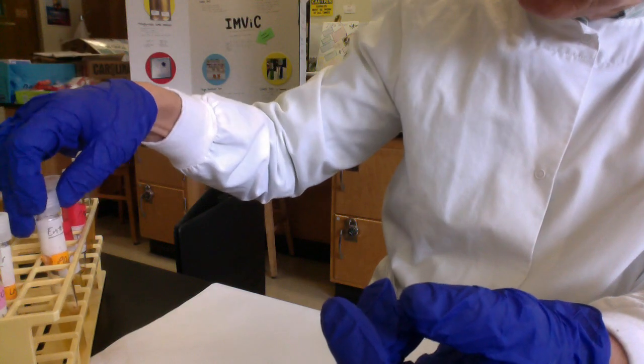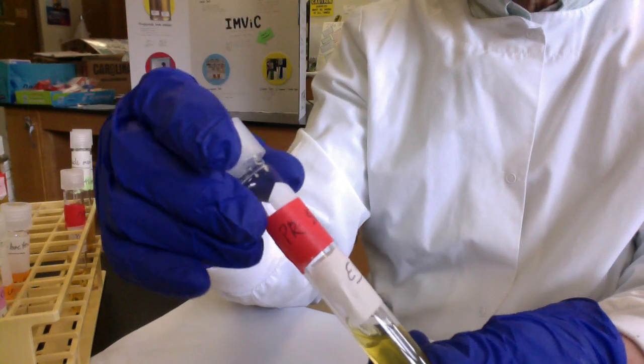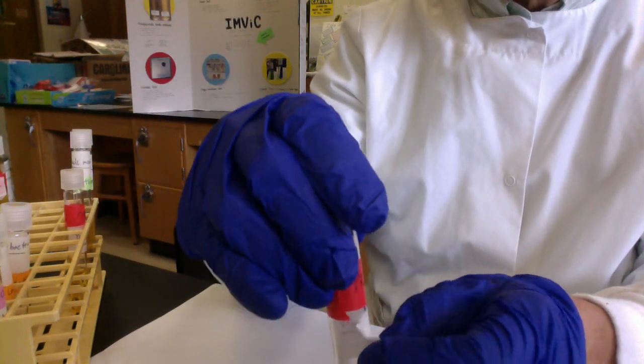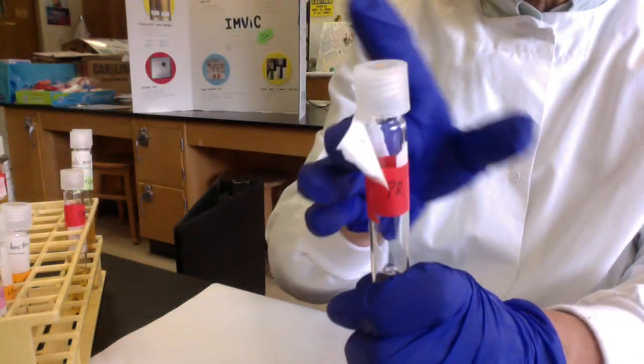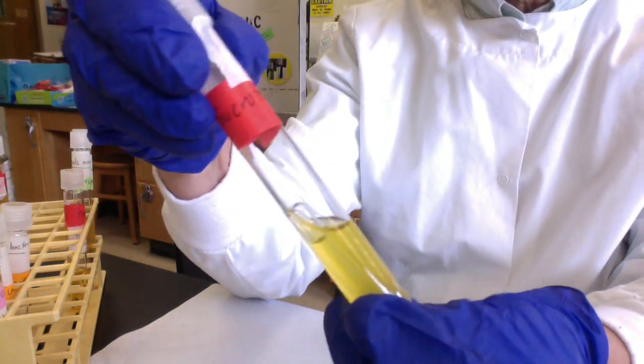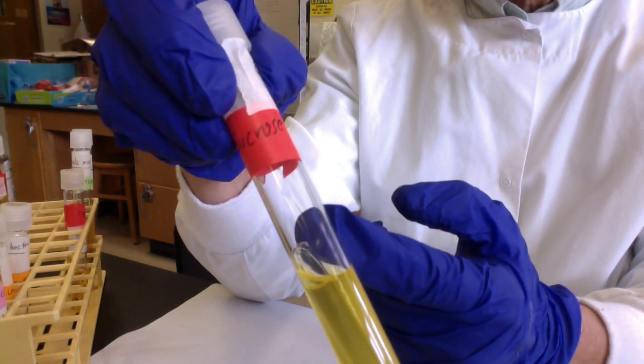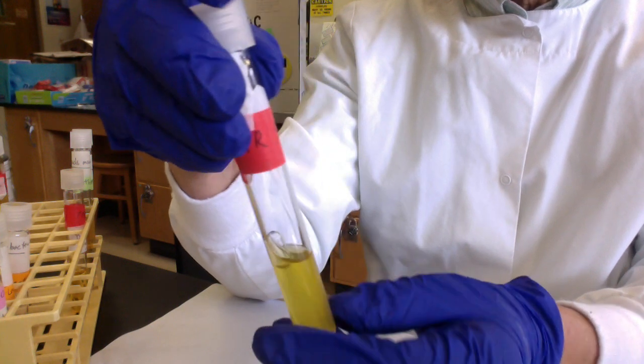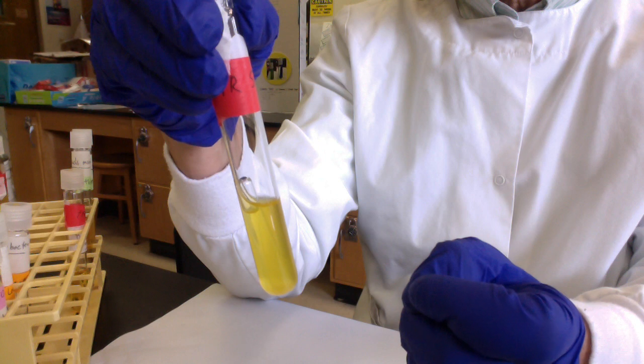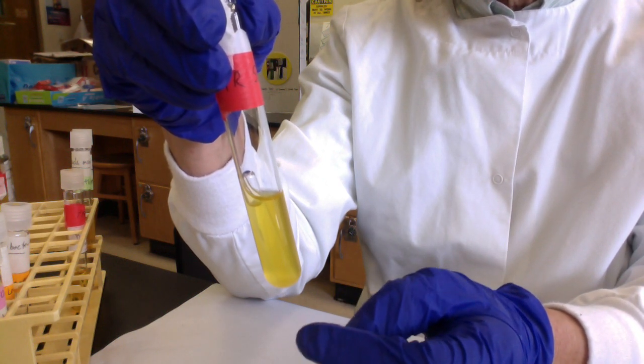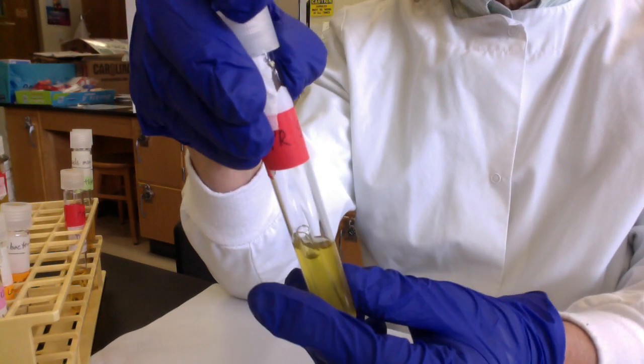Here we have E. coli in PR sucrose. E. coli must make sucrase because it fermented the sucrose. We'd score it A/+ for acid and gas. So E. coli can ferment glucose, lactose, and sucrose. E. coli makes beta-galactosidase to digest lactose and sucrase to digest sucrose.